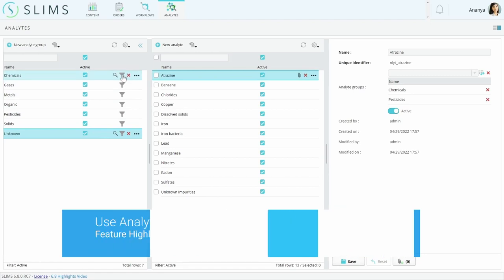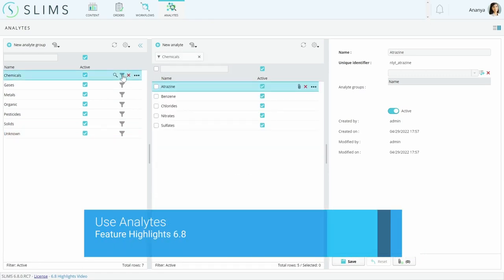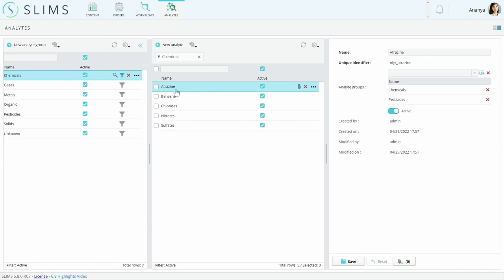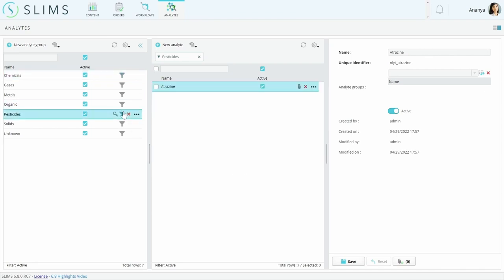Analytes are easier to create than tests because they are so simple. You can categorize analytes into multiple groups, like how atrazine is in chemicals and pesticides.